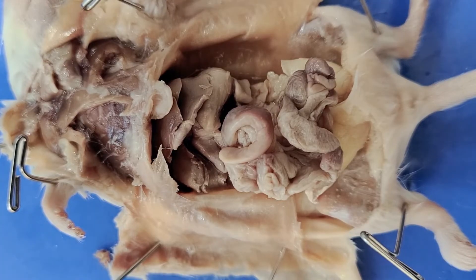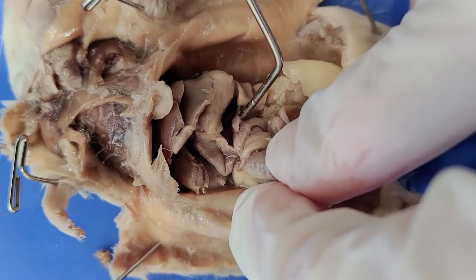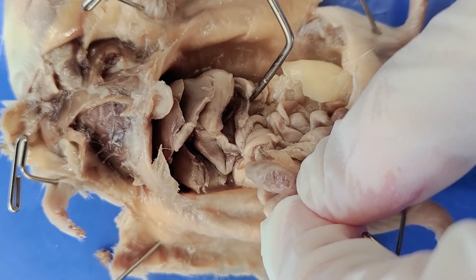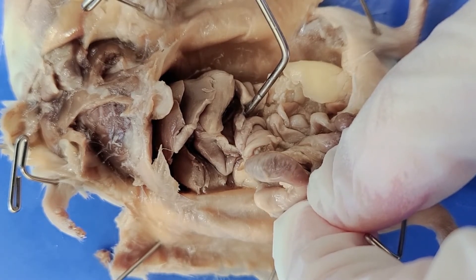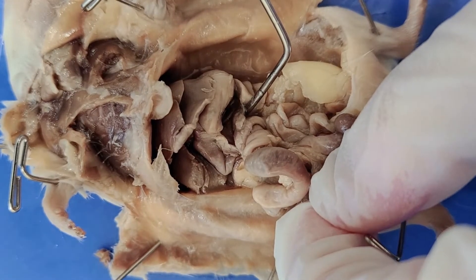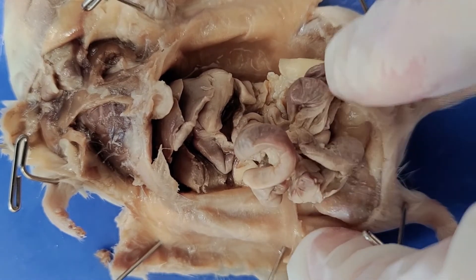Next to the stomach is this structure here, which is small and kind of hard to see — this is the pancreas. The pancreas has two main functions: to produce digestive enzymes, and to produce hormones. It produces digestive enzymes that break down food and neutralize the acidic pH from the stomach, releasing these enzymes into the small intestine. It also produces hormones like insulin and releases it into the blood.